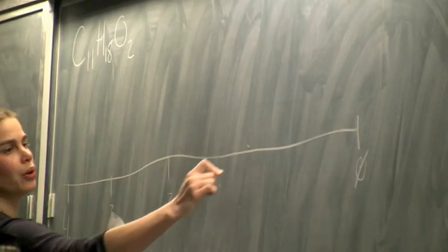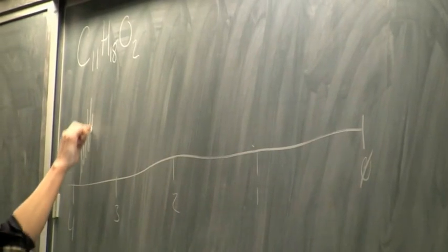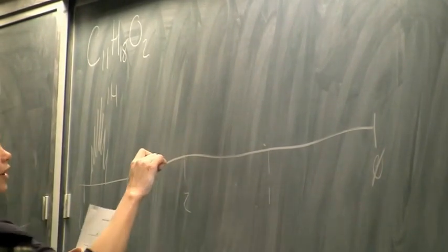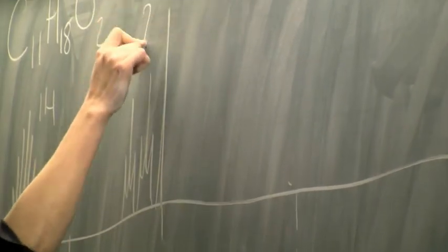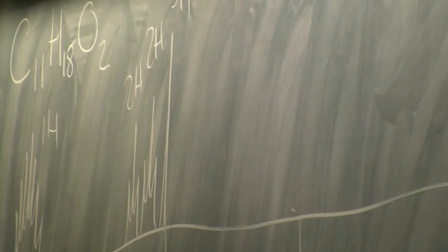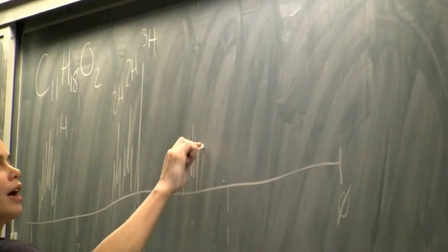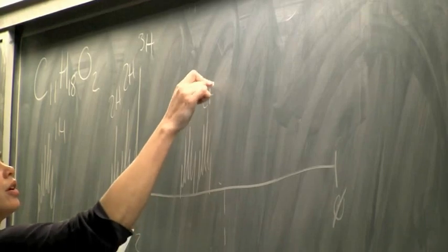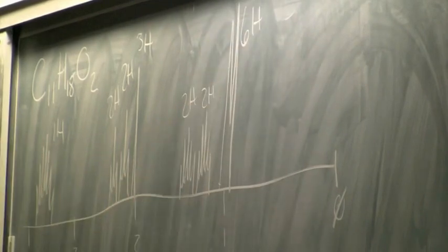We've got 7 peaks: 1, 2, 3, 4, 5, 6, 7. 1H, way down by 4. A cluster of stuff up by 2.5 to 2. Triplet, triplet, singlet, 2H, 2H, 3H, some fancy pentets, each of these 2H, and right around 1, a big 6H jump. So that's our proton spectrum.